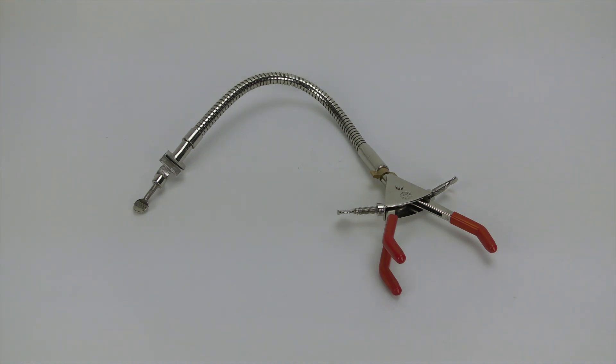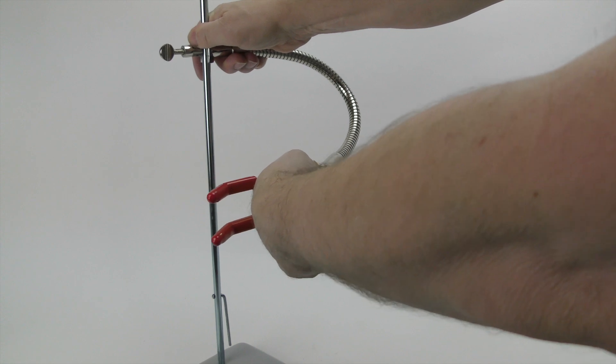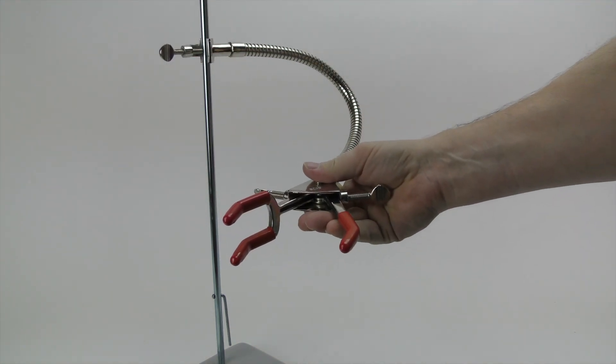This clamp has a 12 inch long flexible arm that allows you to customize how it is orientated. The arm takes a little effort to hold its shape, but that ensures that it stays put and holds your apparatus exactly where you want it.